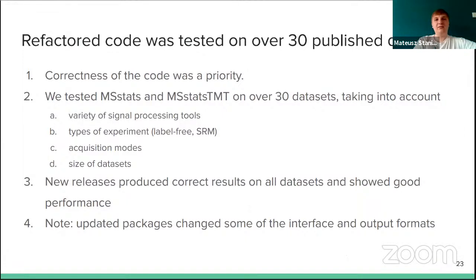Another thing is that while basically rewriting the code base from scratch, we had to make sure that the new code does exactly what we intended with no bugs. So we made sure of that by testing it on over 30 published data sets.